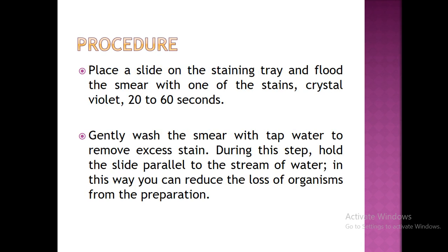Procedure: take a clean glass slide, prepare a smear of the bacterial culture at the center of the slide, and then flood the slide with one of the stains. If you are using crystal violet, you can flood the slide with crystal violet for 20 to 60 seconds. Then gently wash this smear with tap water to remove the excess stain.